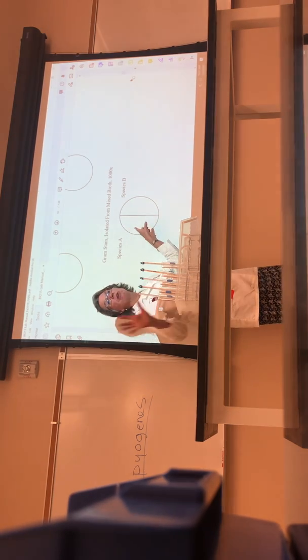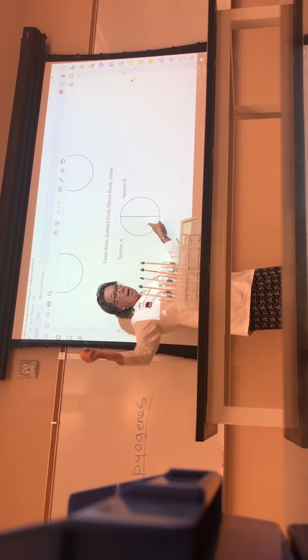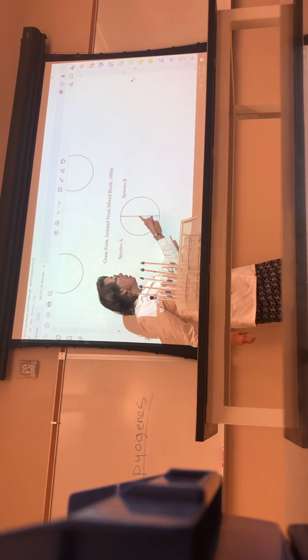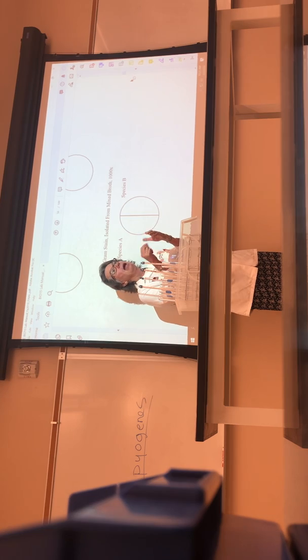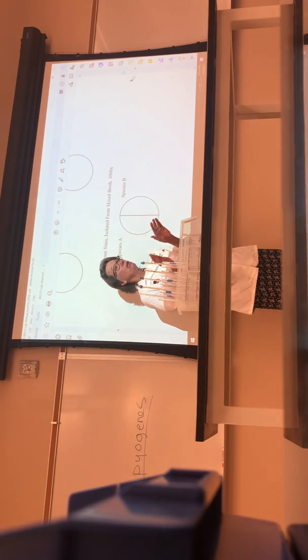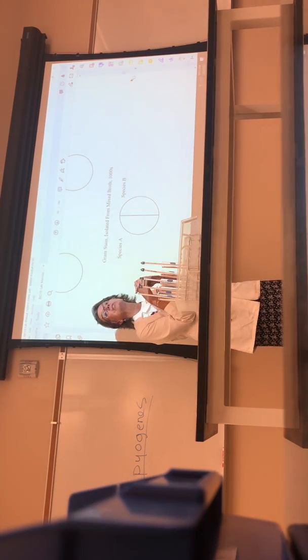So guys, look up here, guys. If you have, for example, species A is a gram negative, that's the one that you should have on your McConkey. And you're just going to confirm it by gram staining the slant, okay? But if species B is a gram positive, today you're going to take that species B colony type and streak it for isolation on a brand new plate. So it's growing on the plate all by itself. Because what we're going to try to do is get each of the bacteria growing all by themselves on a plate and then transfer them to a slant.